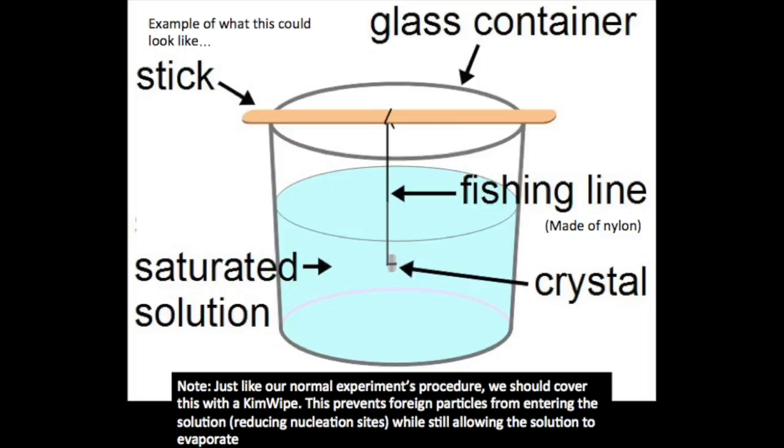This can be achieved by suspending one of the seed alum crystals we have with the nylon string in a saturated alum solution. Nylon is used because it is smooth, and this minimizes the chance of crystals forming on the string. This way, alum molecules in solution are able to aggregate on all faces of the alum crystal, enabling it to grow larger. If crystals do begin to form in other places, they need to be removed. Note: the suspended alum crystal has to be completely submerged in saturated alum solution at all times. In this new procedure, the same slow evaporation crystallization technique would be used.